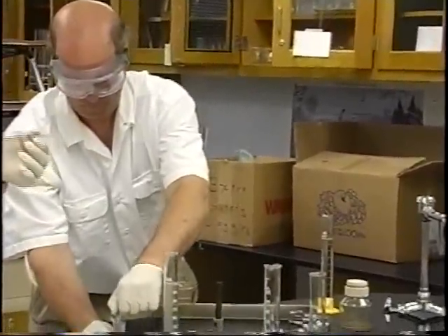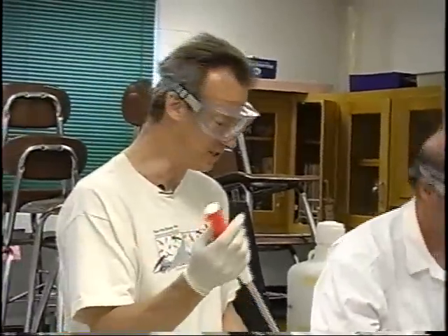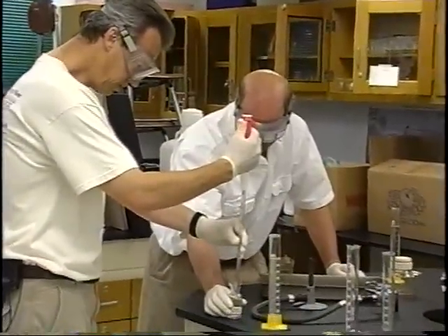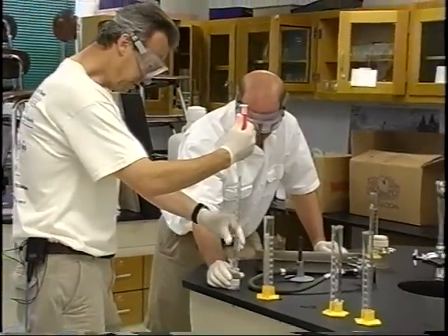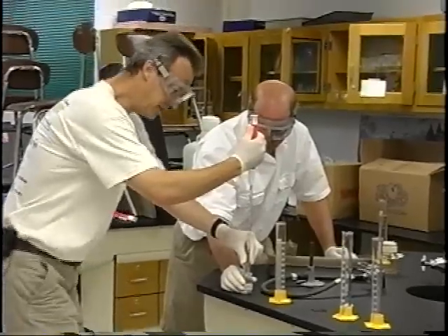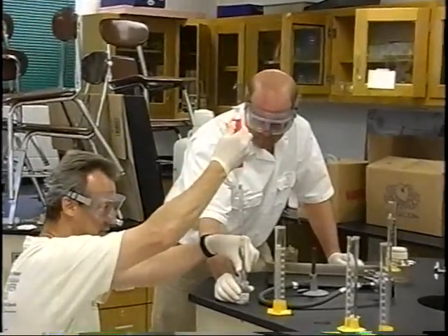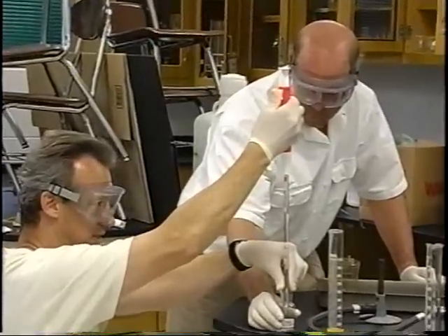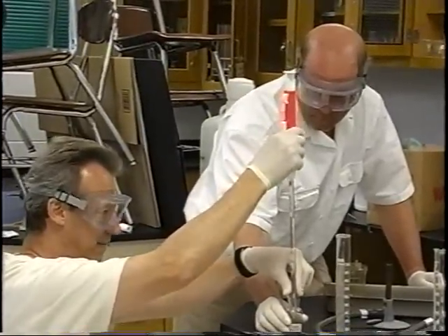Now the capacity of this pipette is only 10, so we're going to have to run 2 samples out of here. Thank you very much. So I'm going to fill this to 10. It's graduated like a cylinder. It's even more precise though. And you can control it with this thumb screw. There's exactly 10.